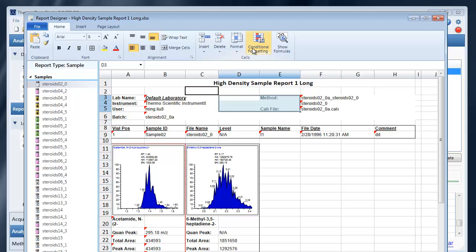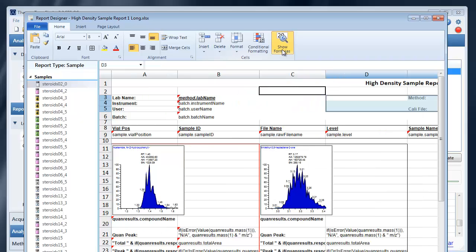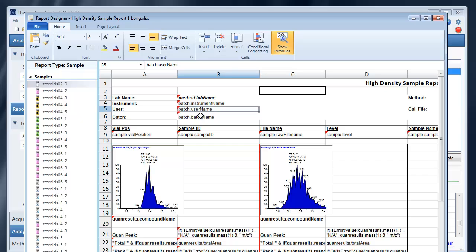You'll see conditional formatting. We'll come back to that in a later tutorial. And you have the ability to show formulas which will expand out the bound fields to show their respective formulas that they're bound to.